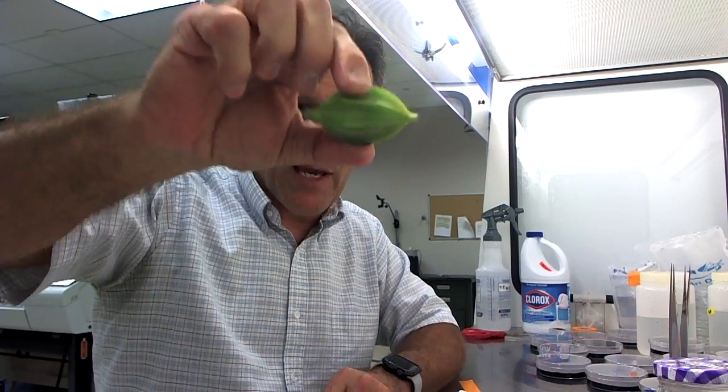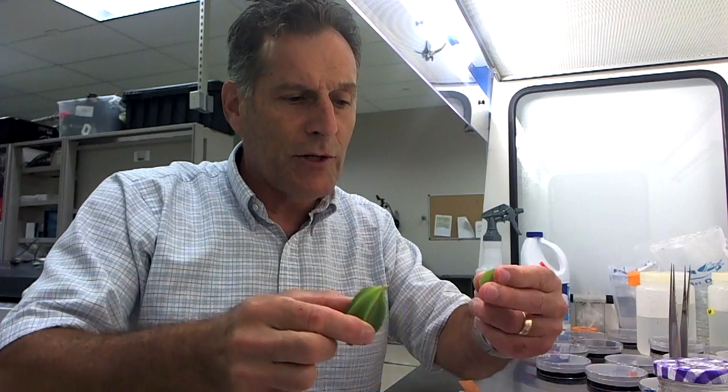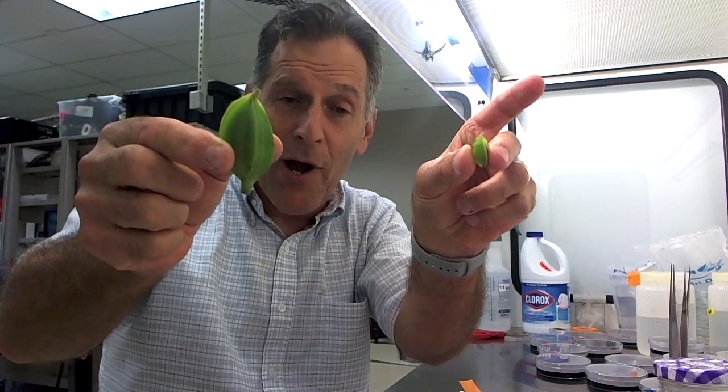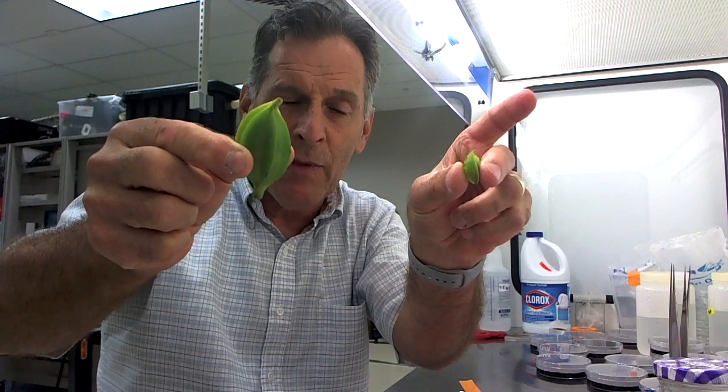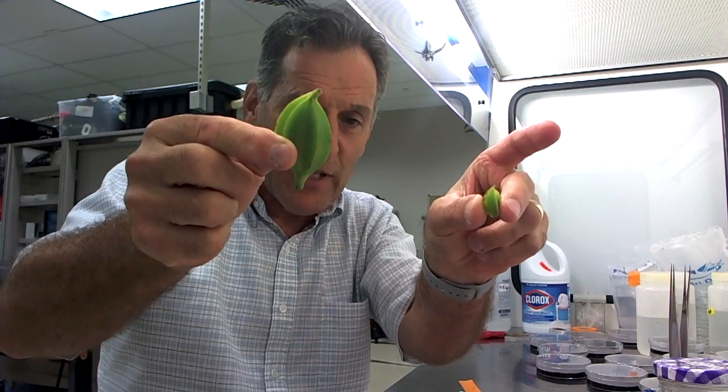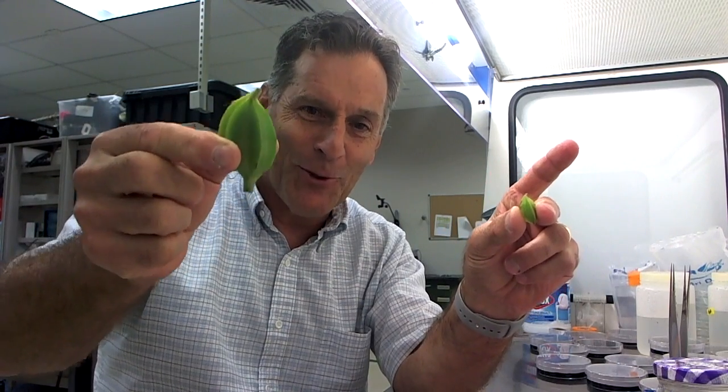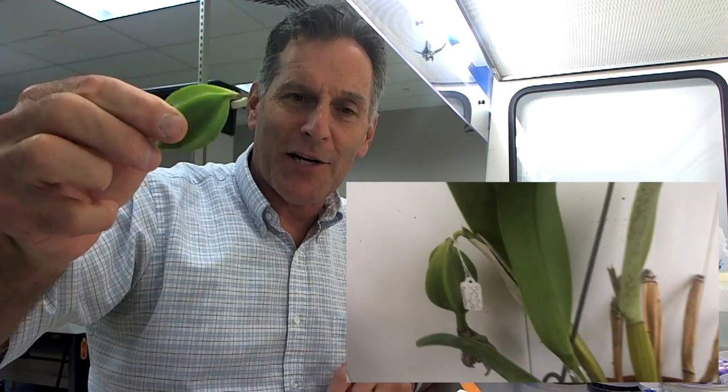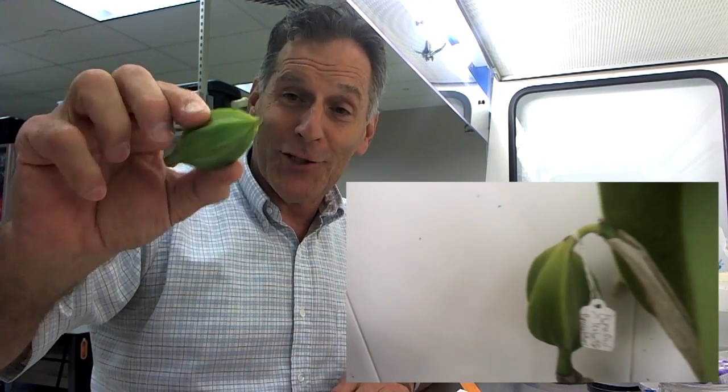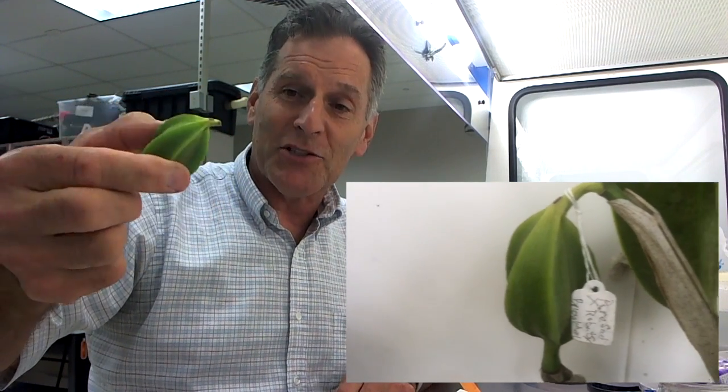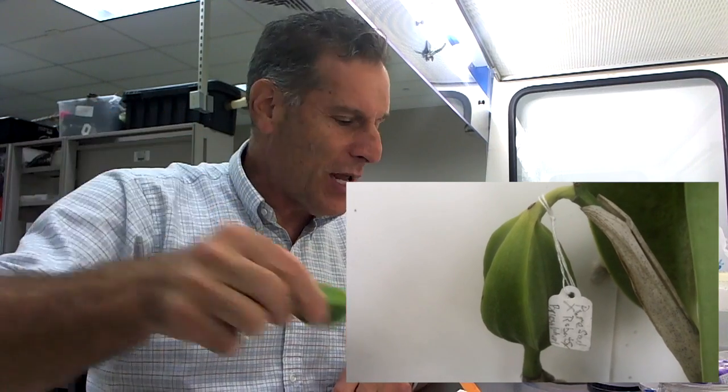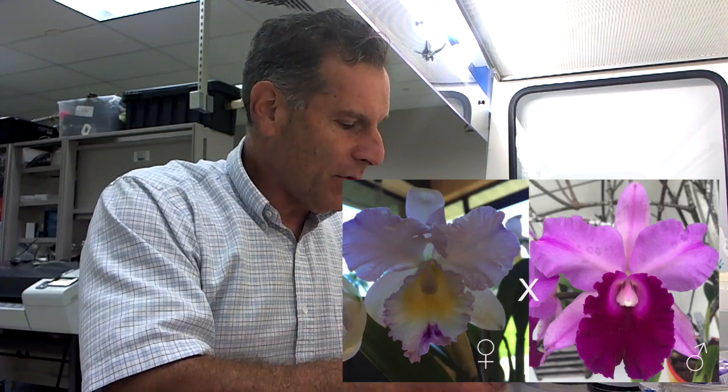The seed capsules: first of all, I have a seed capsule from a cross that I made. This is from a cross I made right here, and this is another seed capsule that was provided to me. There may be fewer seeds in this capsule than this one. This is from a cross I made, a Cattleya cross, and it should give me a lot of seeds. It's been about six months since I pollinated, so this guy should be ready to go.